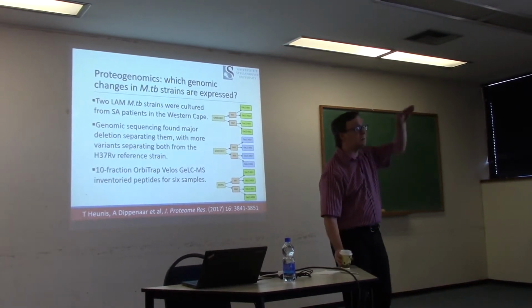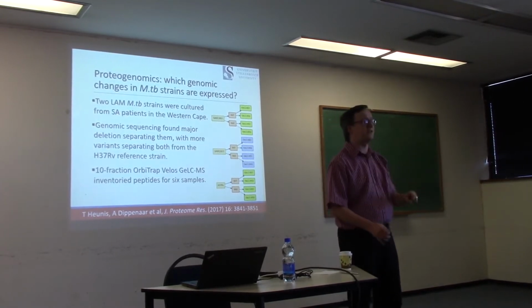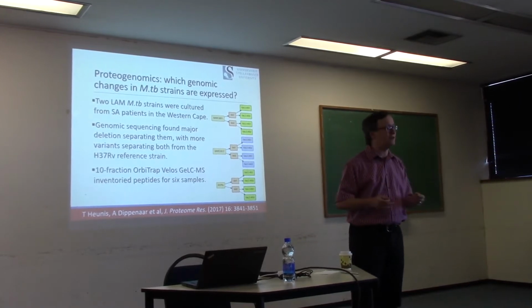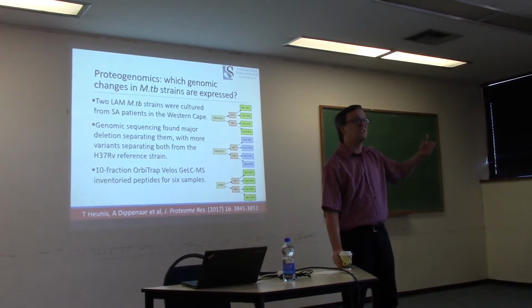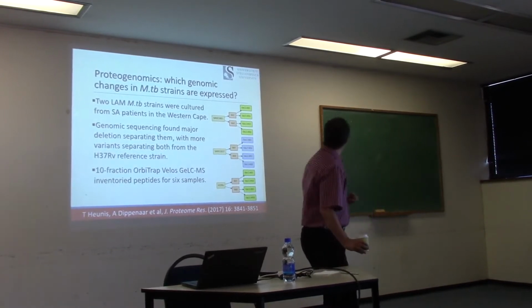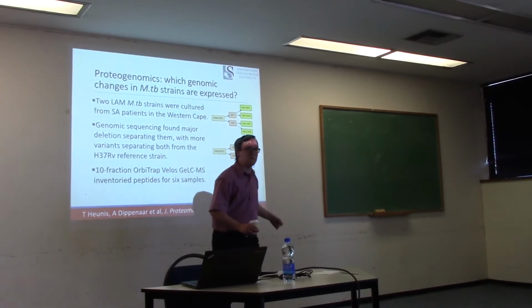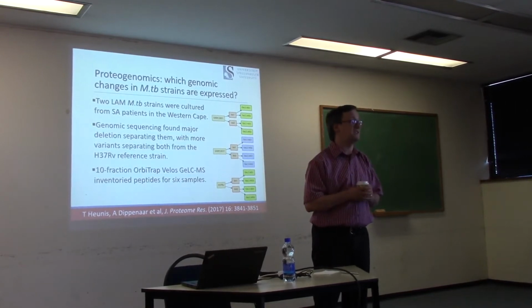This is a case where you separate the proteins out on a 1D gel, and then chop up major sections of that into tiny little diced pieces, digest the peptides out of that, and run, in this case, 10 different LC-MS/MS experiments from each gel. So if you look at this, you see that there are 12 gel-LC-MS experiments, each of those spanning 10 LC-MS/MS files.